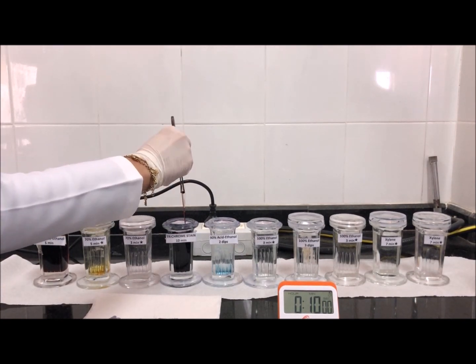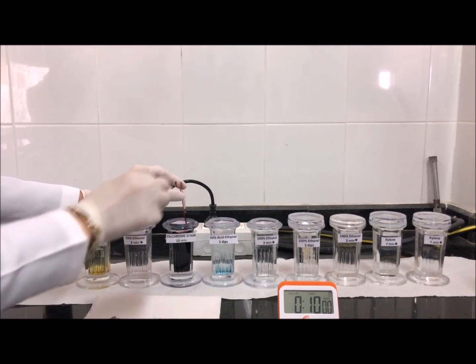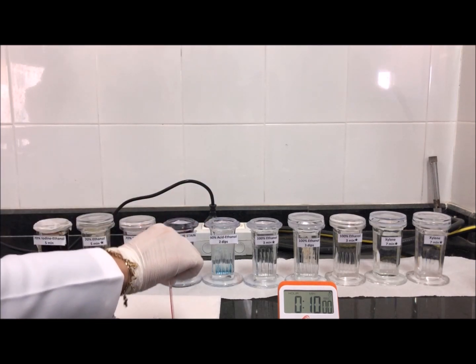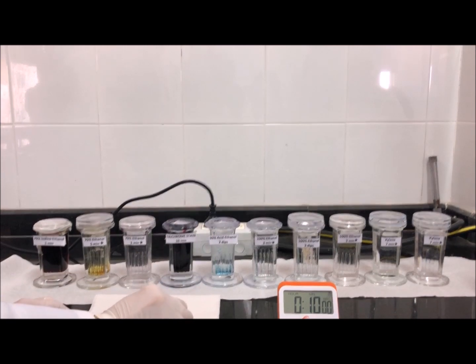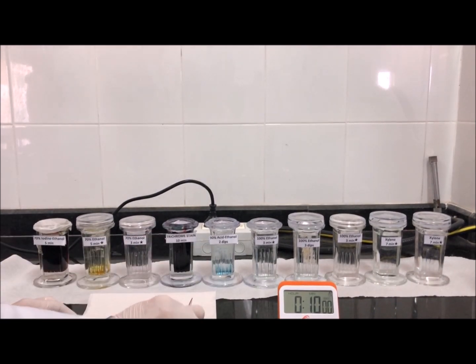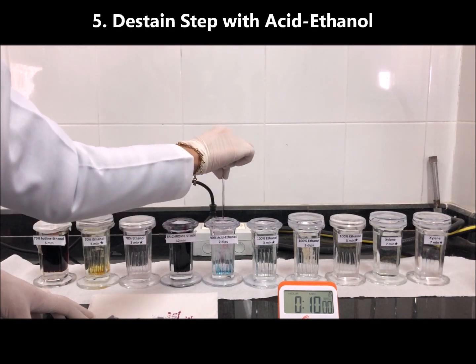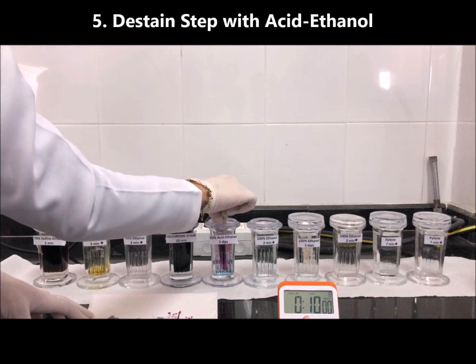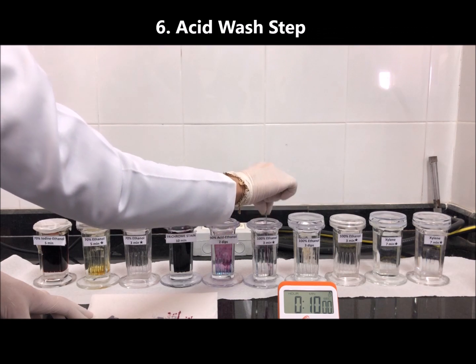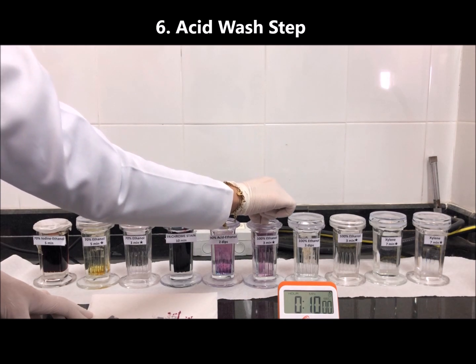After 10 to 15 minutes in the trichrome stain, remove the slides, tip them against the side of the jar, and blot on tissue paper. Then give just two dips in the destaining solution. Then five dips in the next solution to remove residual acid, because acid might continue to destain the trichrome stain, negatively affecting the staining quality.